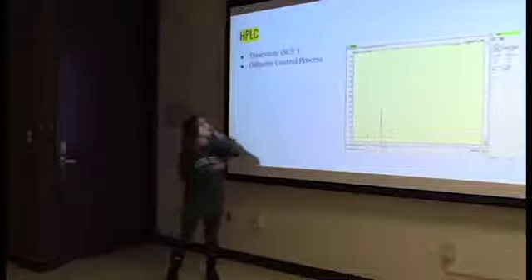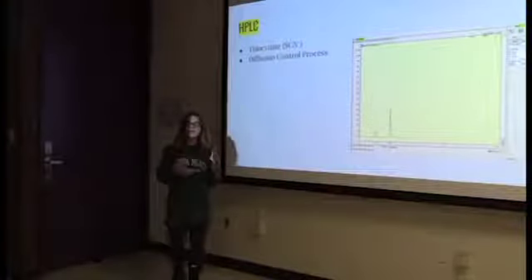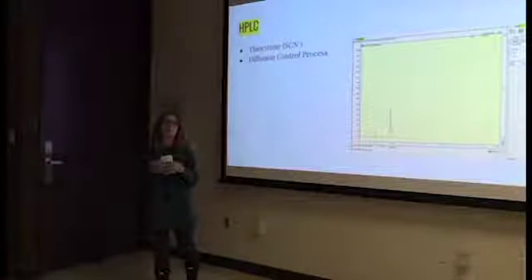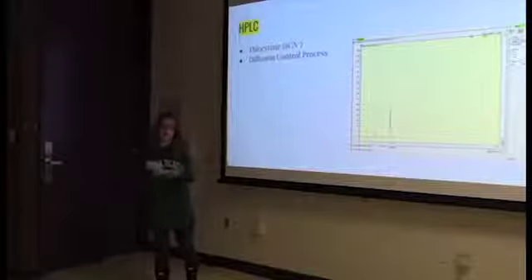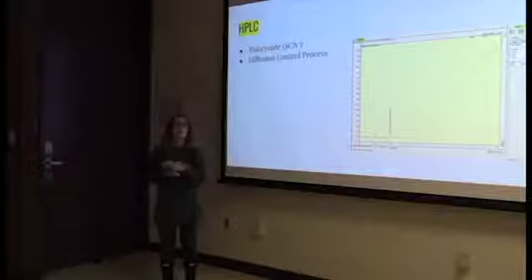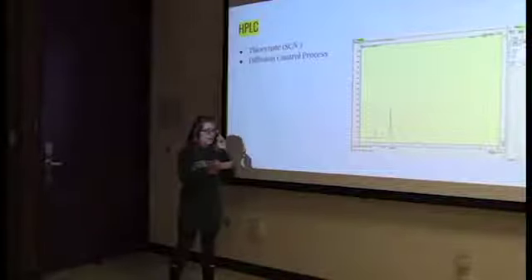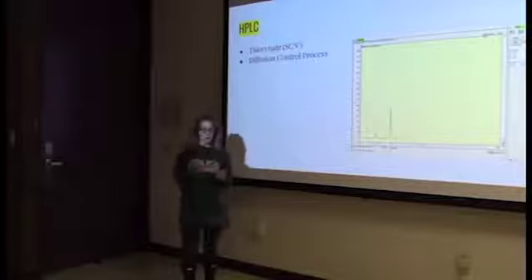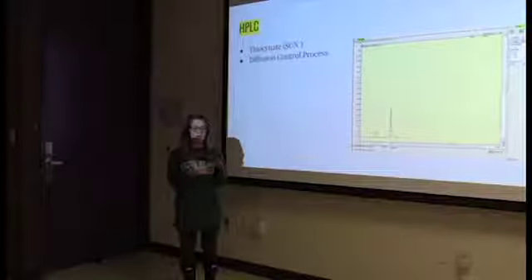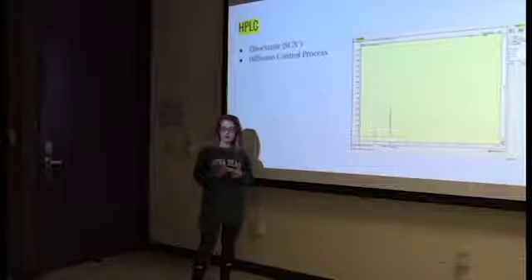So this is thiocyanate. We did a little bit of background research just to find how the ratios would work for iron to curcumin. We used thiocyanate as that's a known 1-to-1 ratio with iron 3+. What happens with the 1-to-1 ratio is that there's a peak at 5 minutes, the intensity is about 850.